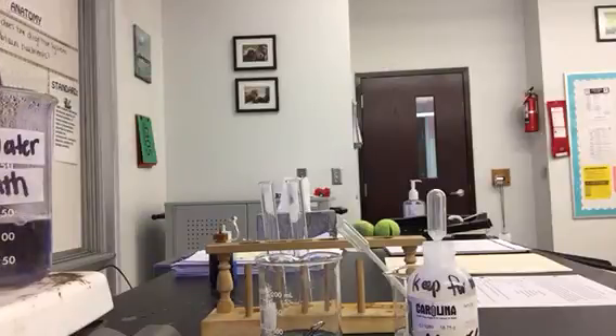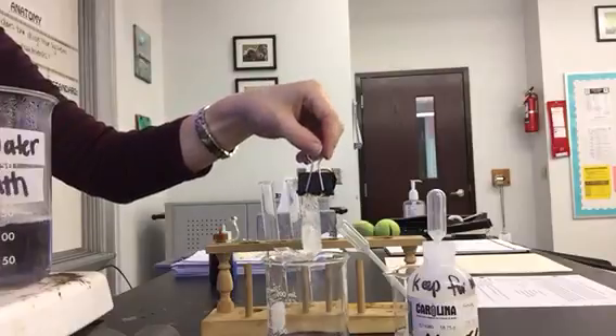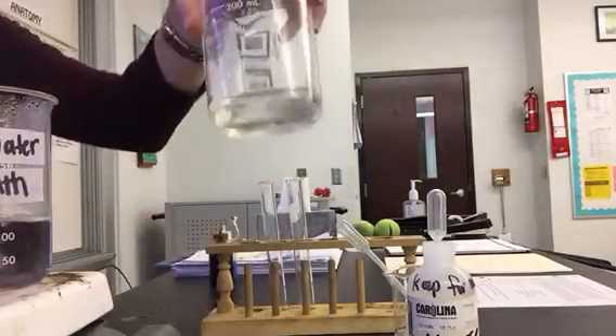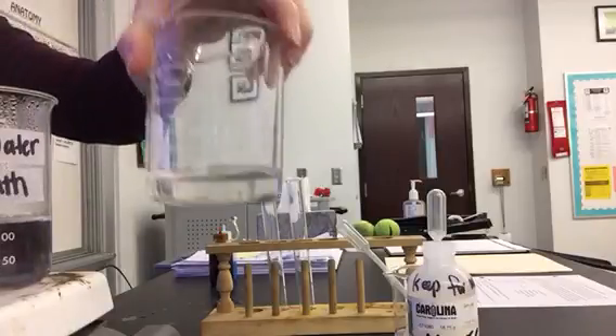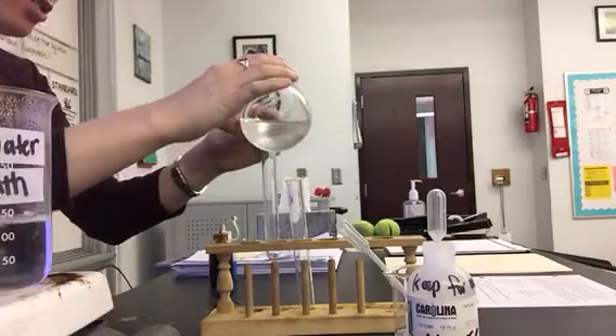It's been about 30 minutes, and I'm going to take the dialysis tubing out. We're just left with the water and anything that came out of the dialysis tubing. I'm going to pour about 5 mils into each of the tubes.